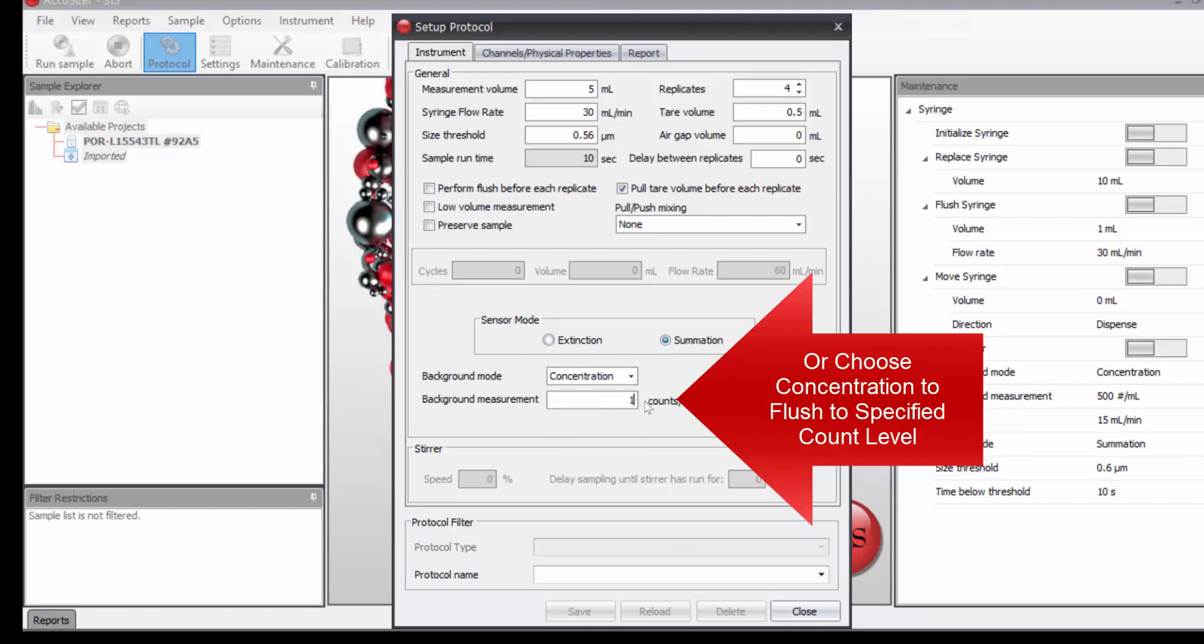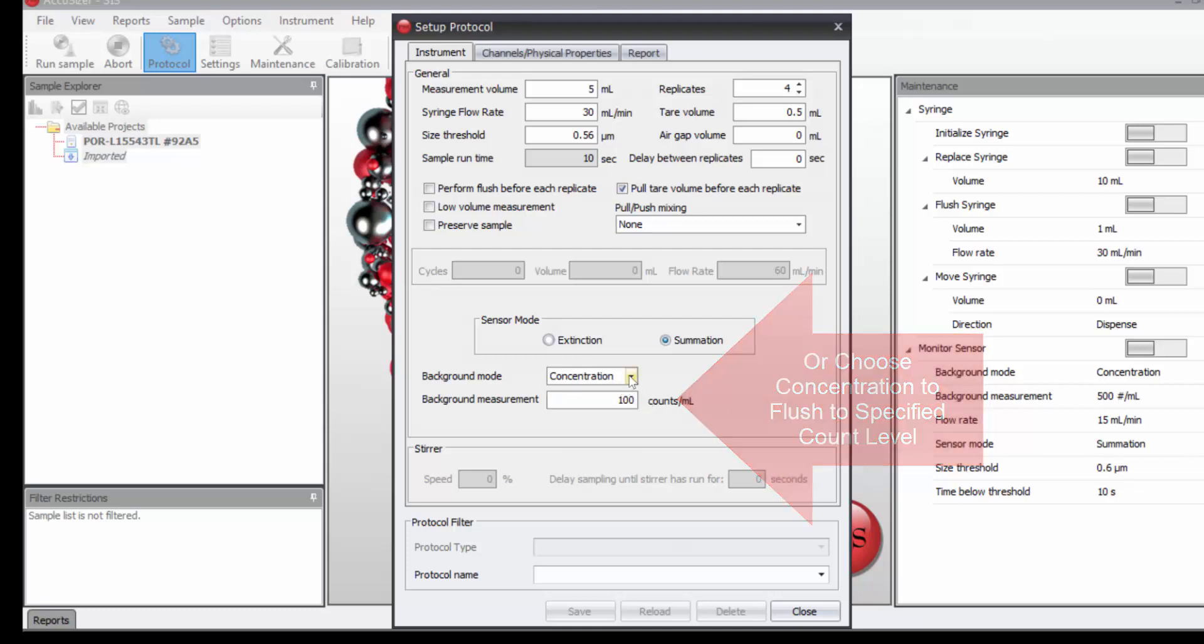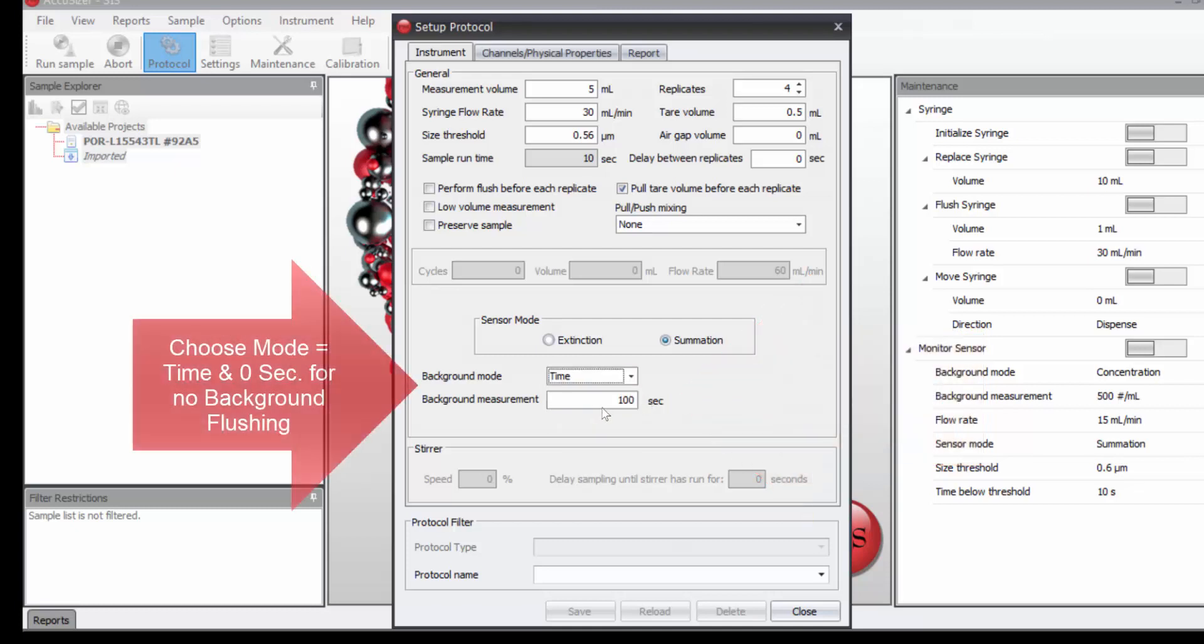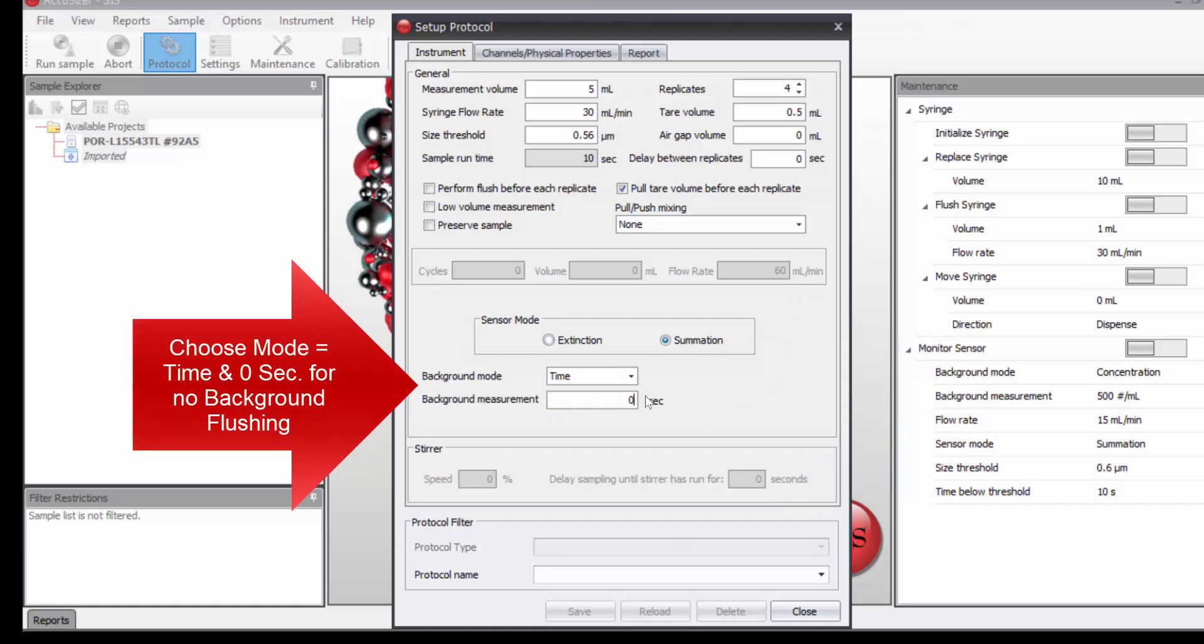for instance, till I'm below 100 particles per mL. But since I'm not doing a background test, I'm just going to set this time to 0, then there will be no background test before the measurement.